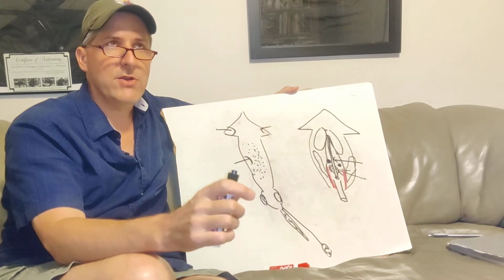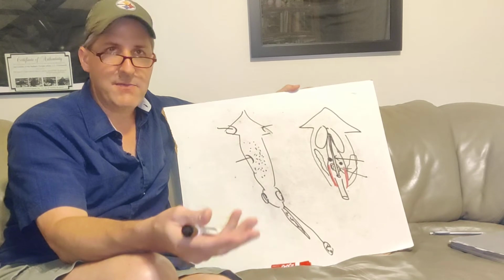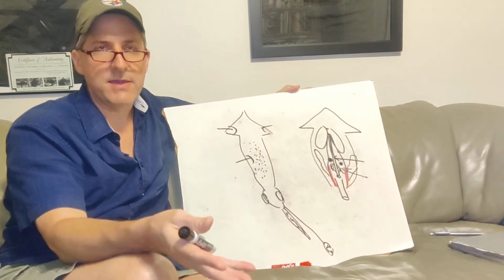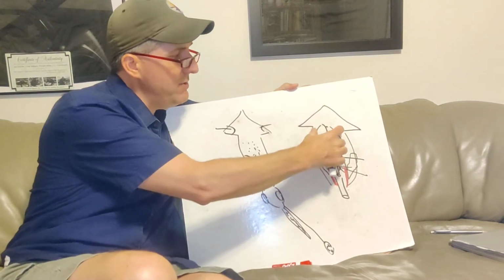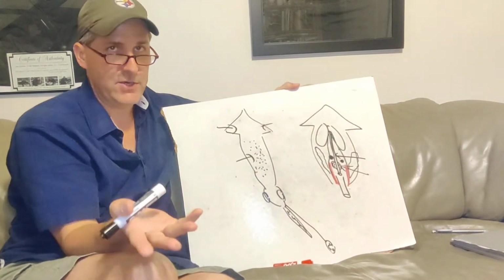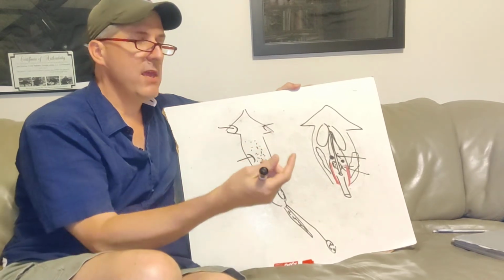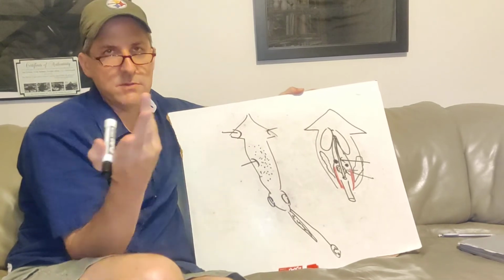Ovaries tend to be larger and they tend to be a little harder. They're orange because of all the fat to make the eggs. They're harder again because of making the eggs. If you had one that was actually ready to breed, these ovaries could be enormous, which meant that the entire digestive tract could shrink down to nothing because she's ready to breed. If you took the ovary and just pinched it, you'd feel these little tiny granules on your gloves. Well, those are the eggs.